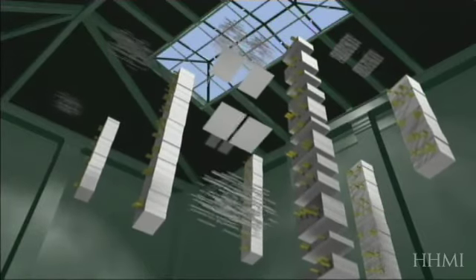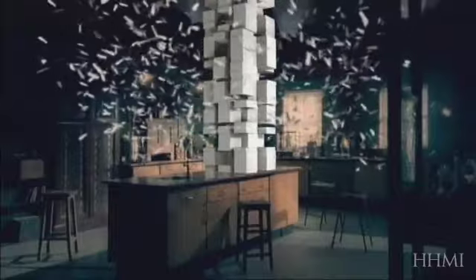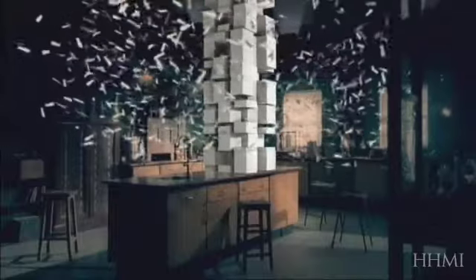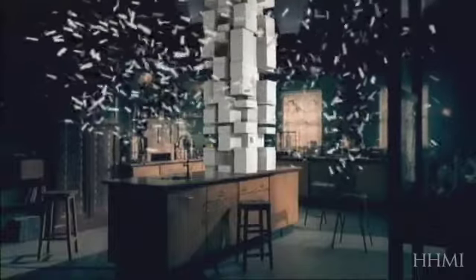This methodical process produced huge amounts of data that have been used to virtually reassemble our genome. However, there are gaps. Repeat sequences are common in the human genome, so repeats from entirely different chromosome regions may be erroneously joined together. It will take many years to detect mismatches caused by the repeat sequences. Some regions, especially near the centromeres, may never be fully finished.